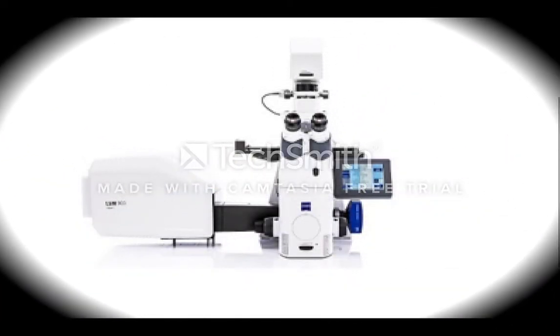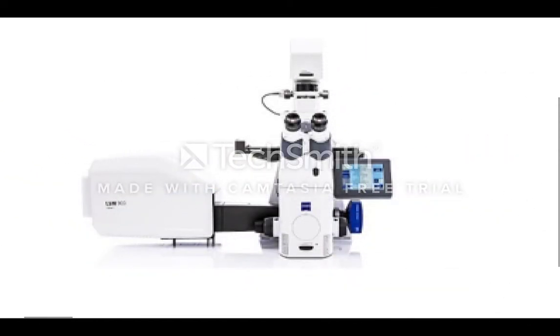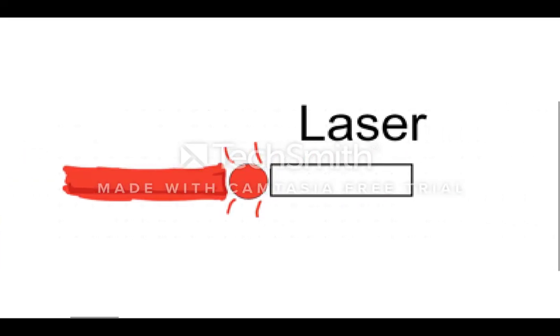Going into depth, a confocal microscope consists of a laser, 2 pinholes, a dichroic mirror, objective lens, and a photodetector. Starting with the laser, a beam passes through a light source, being the pinhole.